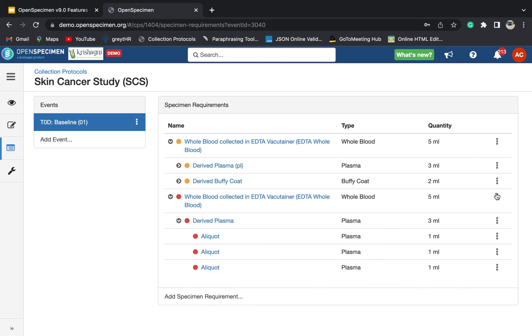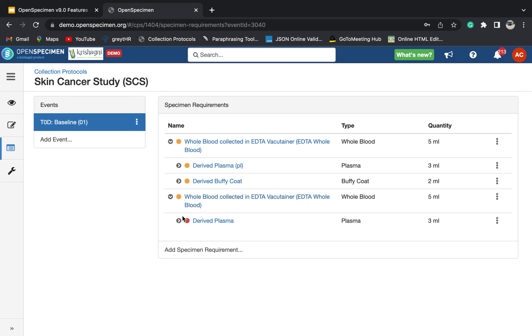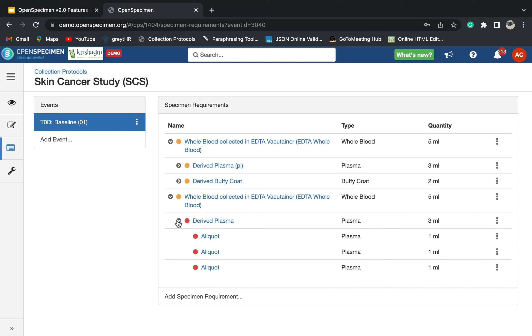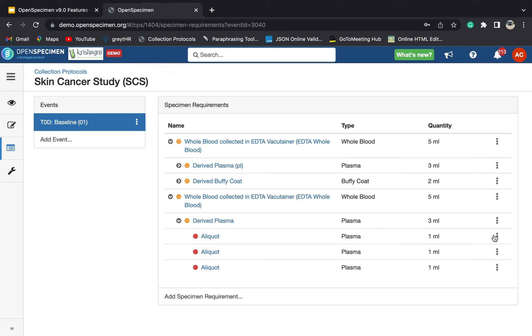If you want to collect those specimens again after closing, you can always click reopen. However, when you reopen the parent, you have to individually reopen each child specimen requirement as well. Regarding the impact of closing and reopening: if you close an event or a specimen requirement, the already-created events or specimen requirements would not be deleted, but you cannot create or collect any new event or specimen requirement of the closed one. Once you reopen, the event or specimen requirement will be available again for collection.